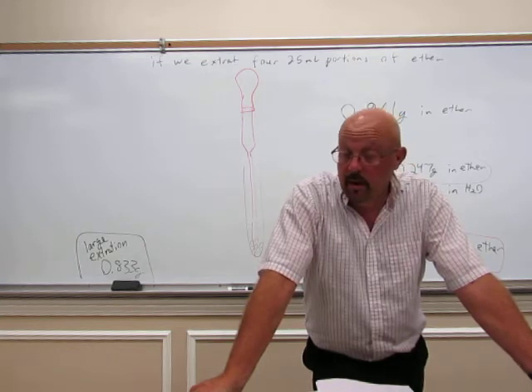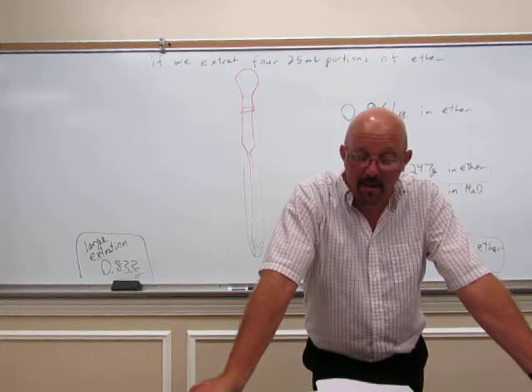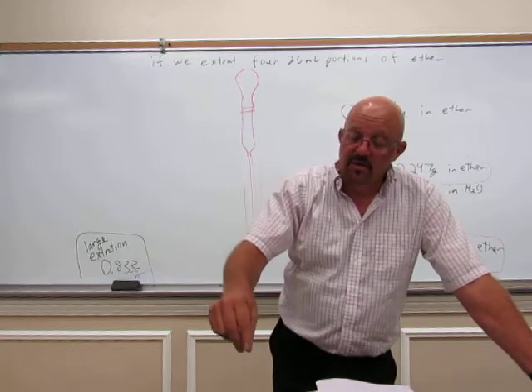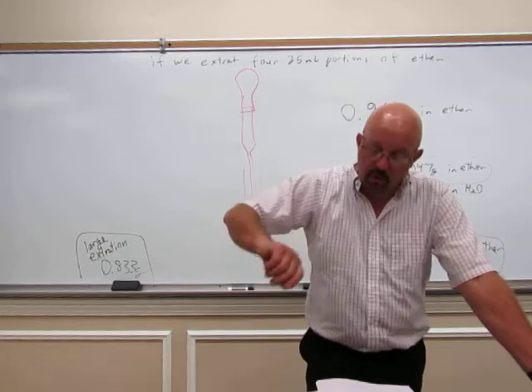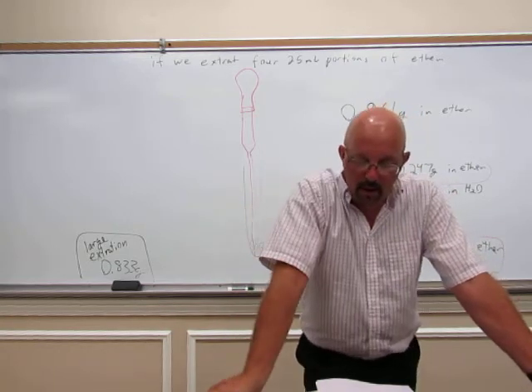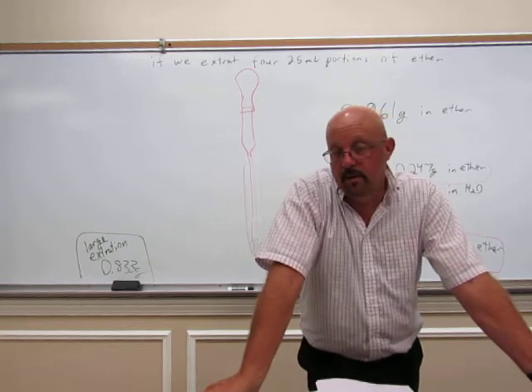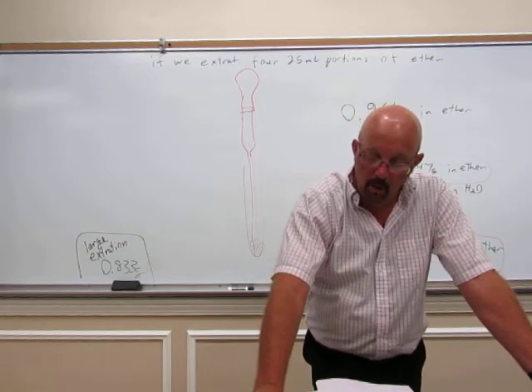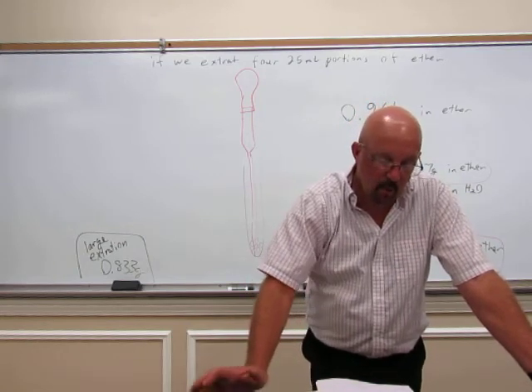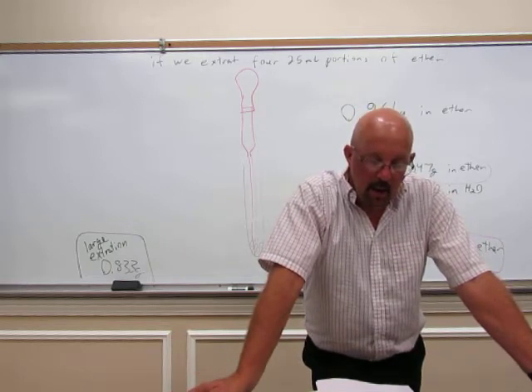You're going to put a boiling stick in the Erlenmeyer flask, and then we're going to heat this on a sand bath. So take the Erlenmeyer flask, just set it on the sand bath. The sand bath has a variac, that's the controller that controls the temperature, and put the variac on a setting of somewhere between 1 and 2. We don't need a very high setting. Dichloromethane has a very low boiling point, so a setting somewhere between 1 and 2 should be sufficient. And we'll evaporate all of the dichloromethane off.